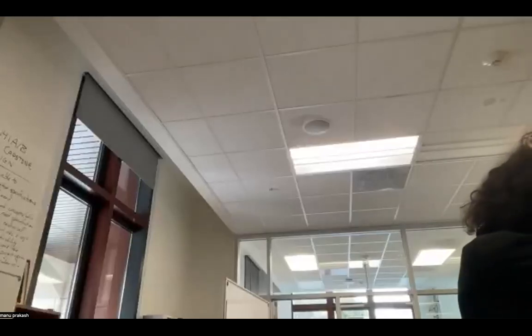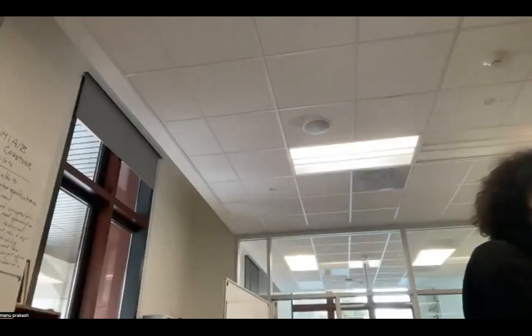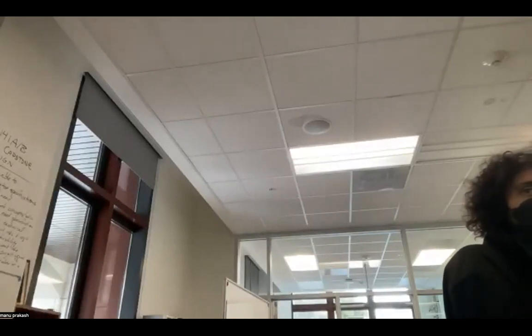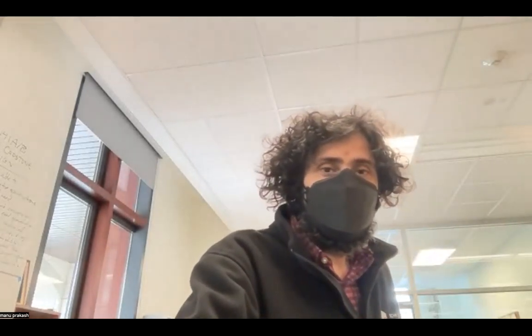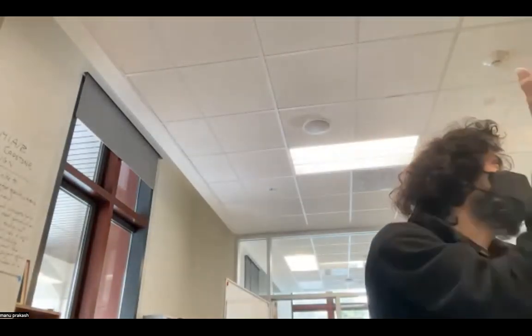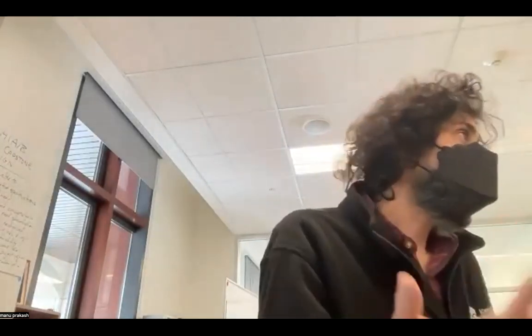What we want to do today is do this. And I think there is a context of thinking a little bit about what you might have seen centrifuges used for. You've seen a little bit on the microscopy front. One of the things to think about is that most of the time, the samples that you were looking at were quite dilute. Even the stuff that you pulled into the water, any diagnostic sample itself ends up being dilute of the pathogens that you're interested in.